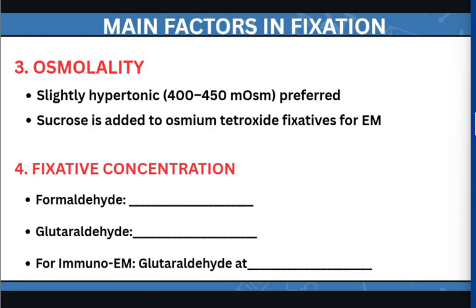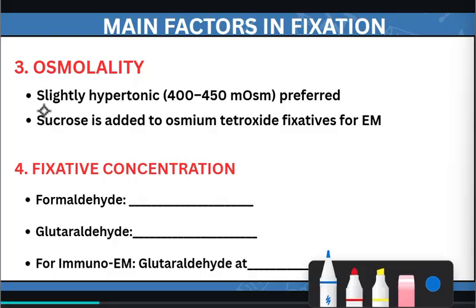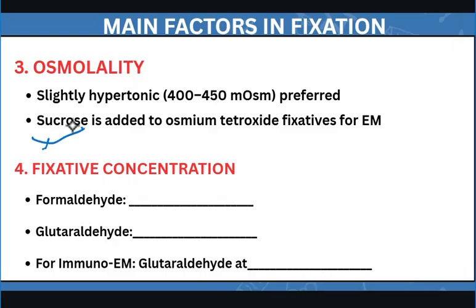Then next we have the osmolality, which, like I told you earlier, slightly hypertonic at 400 to 450 mOsm is preferred, and sucrose is added. Please take note. The sugar sucrose is added to osmium tetroxide fixatives for electron microscopy. What is added? Sucrose is added.